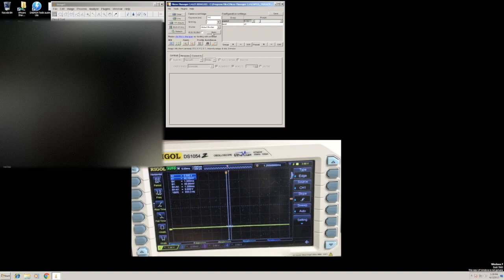So if I say TTL1 on, you can see that I have pulse width modulation here, and then as I adjust the DAC output, you can see that my PWM cycle is going to change from full scale here all the way down to 0 scale. Now I've got this showing right now as an equivalent of a voltage. I can show that as a digital number between 0 and 65,535, or a time for that matter.